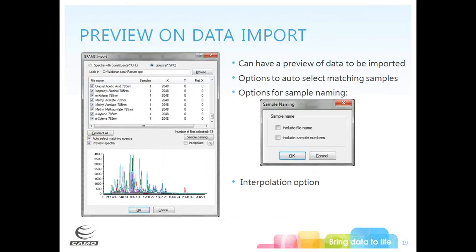One great feature of the import is the ability to preview data before you import it. For SPC data, the grams import allows a preview, auto-selection of matching data files, and options for sample naming. There's also an interpolation function that allows you to align data that may not be perfectly aligned in terms of their X variables — which can happen with instrumental data — and import those together as a single matrix.